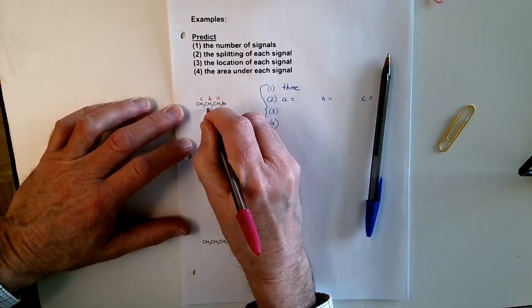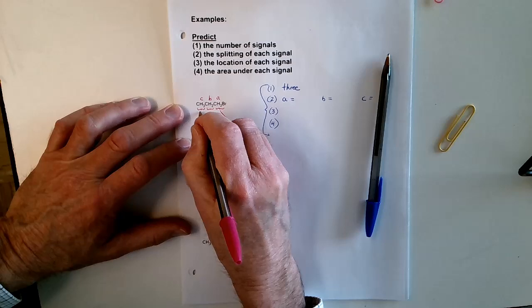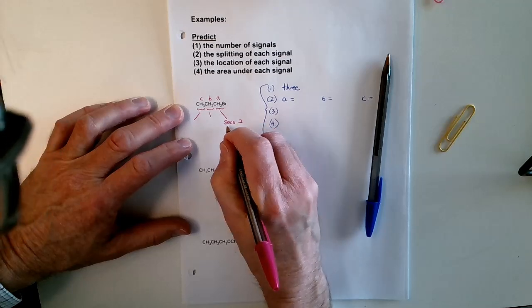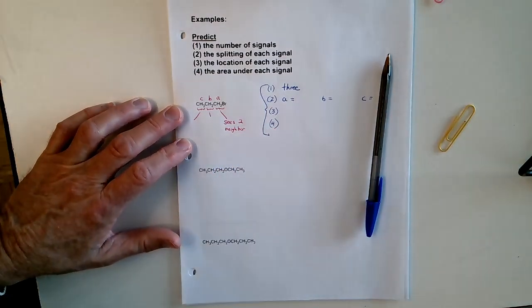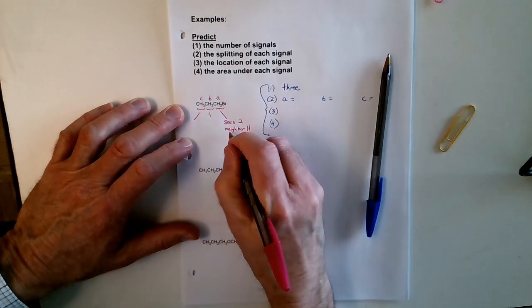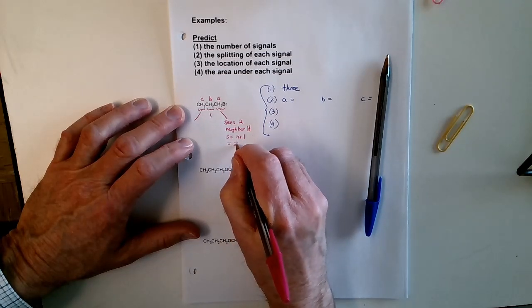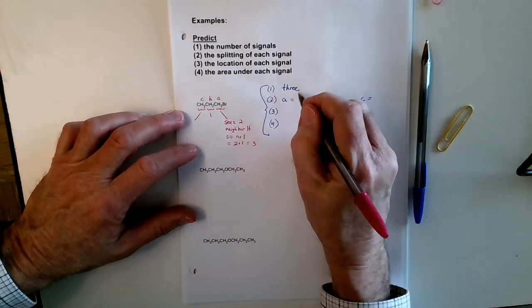Okay, I'm going to give each one of these its own little label and kind of pull them out like this. Set A sees 2, I'll do this one all the way through and then you're going to start doing some with me, sees 2 neighbor hydrogens. So n plus 1 is 2 plus 1, which equals 3. A is a triplet.